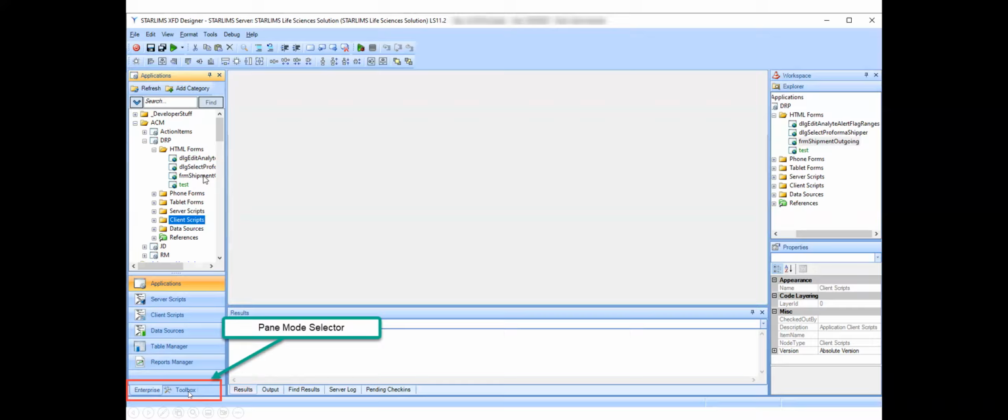The toolbox selector toggles between all of the controls, form types, any of the objects that you can drop on a form. And we're going to be looking at that a little bit later. I didn't drop it in the slides where it should be right in this particular part of the conversation, but we will see the toolbox and we will see all the tools that are appearing in there, and we'll give a small demonstration on how to load those onto a form and use them.